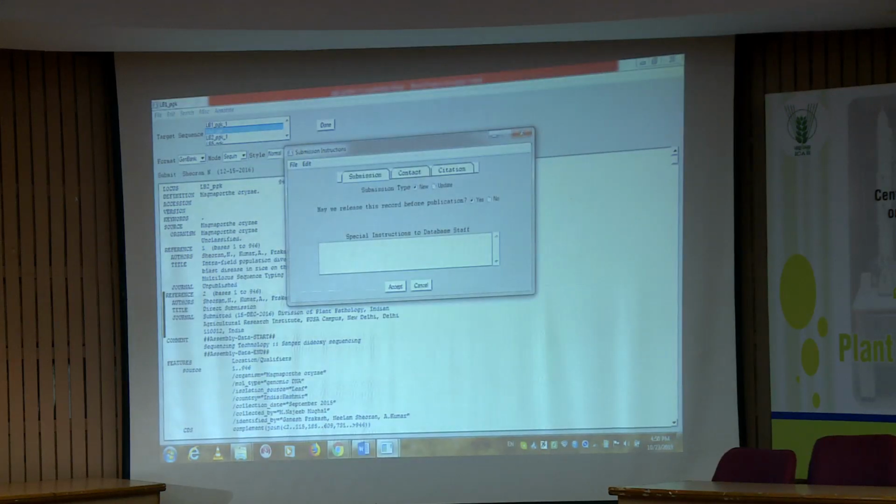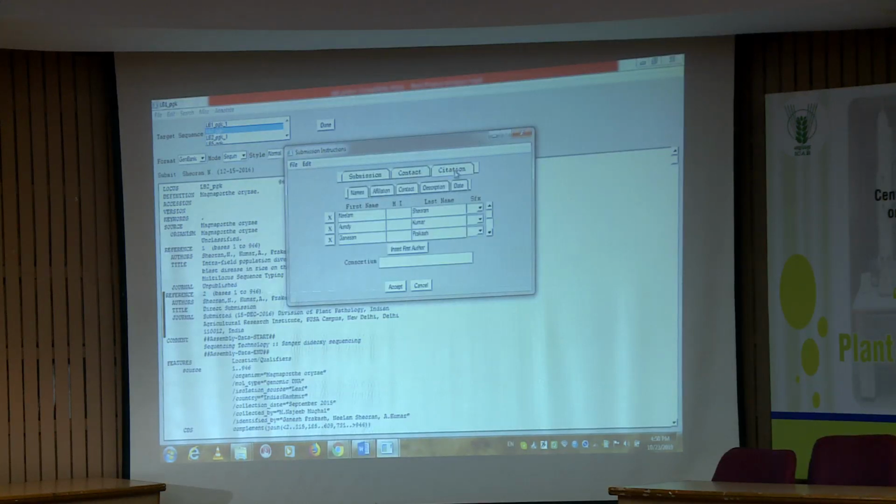I can double click on that, then the option will come, I can change it over here, and then I can save it. This can happen with each and every step. Wherever you want to do the editing, you can do it. Later on also, you first make a raw flat file, then keep on adding or deleting things, whatever is required and not required.